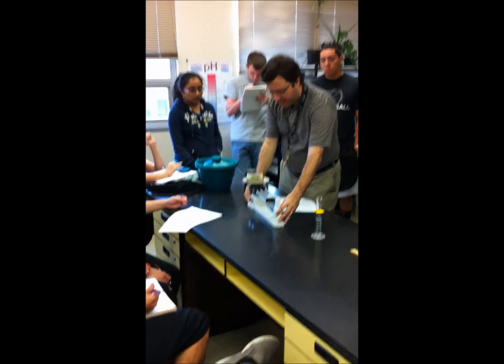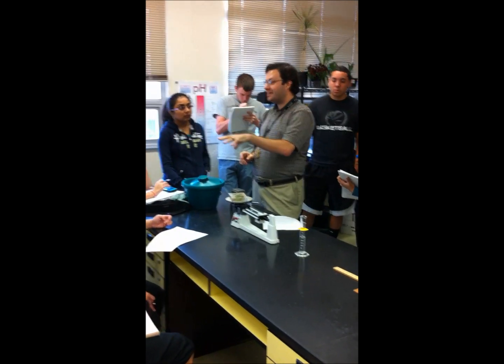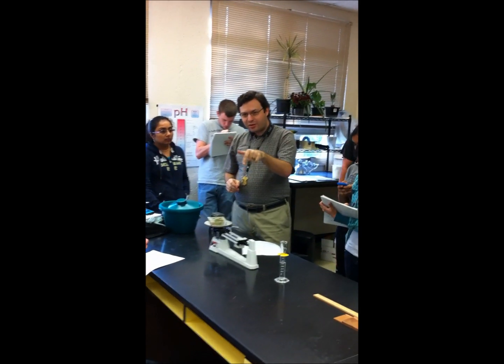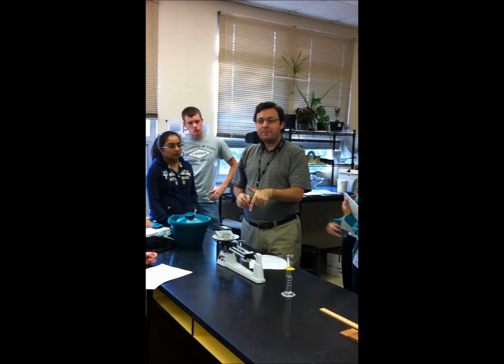On the triple beam balance here, I will make this warning today, and I'll make it again when we get to the test. We are going to set this thing. All you have to do is read it.